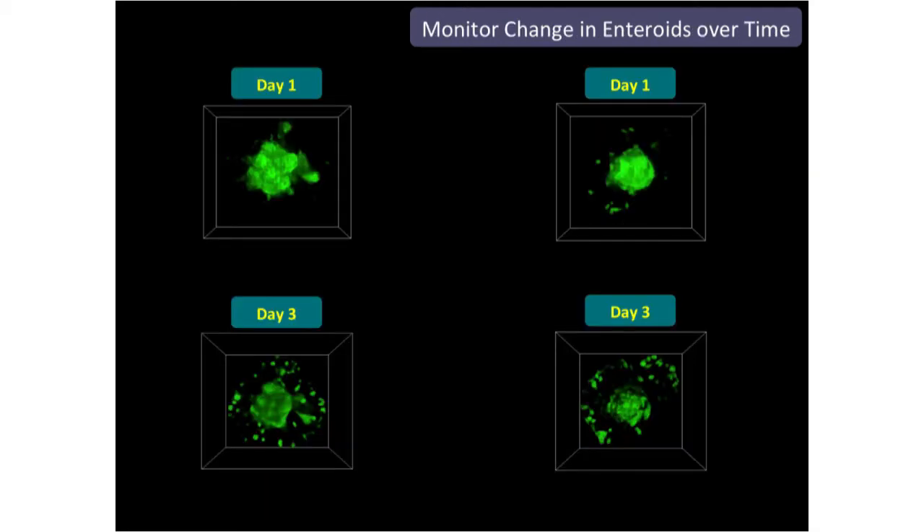Another extension of this approach is monitoring changes over time — imaging the spheroid on day one and then showing the comparison two days later. You can stick with the same sample and image it at multiple time points.